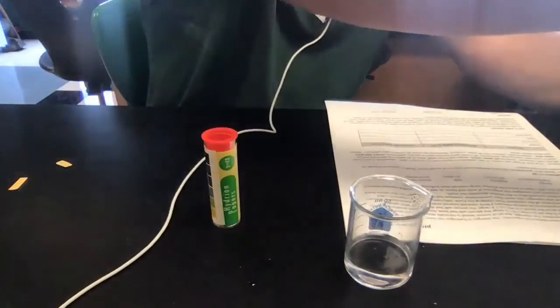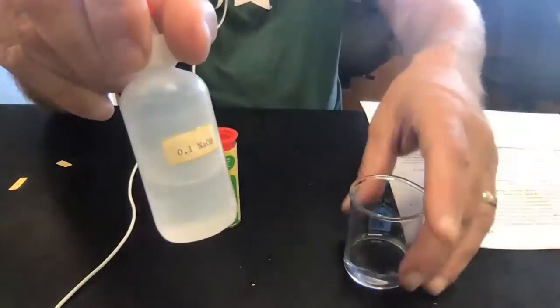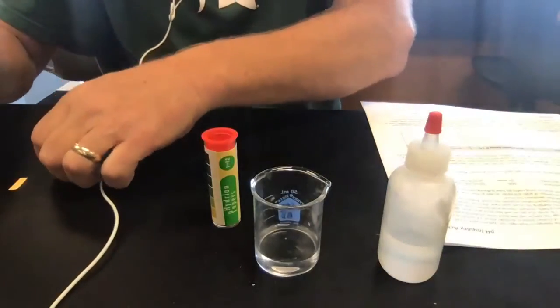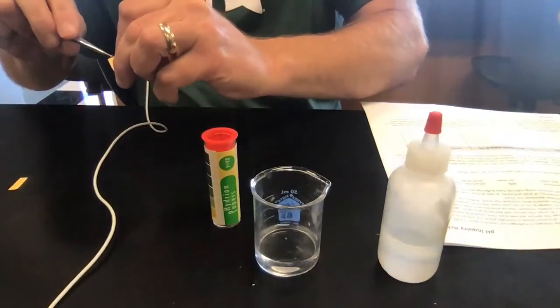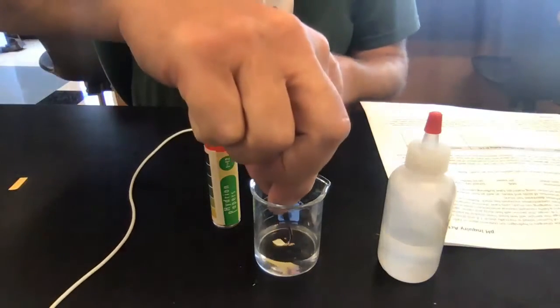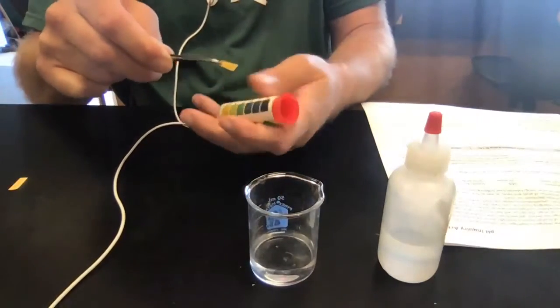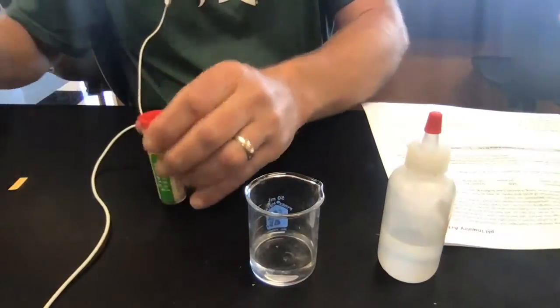Now we do the same thing with the other beaker, adding our base, NaOH, sodium hydroxide. That's going to contribute sodium ions and hydroxide ions. Extra hydroxide ions will raise the pH and make it more basic. So again, I'm going to do an initial pH. I may use a different set of forceps. And again, I'm getting more of a 7.